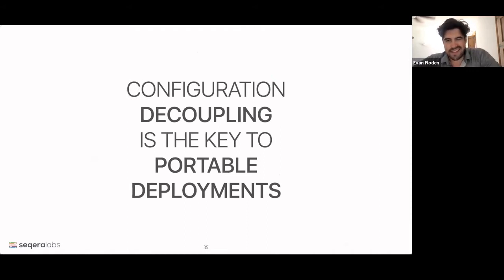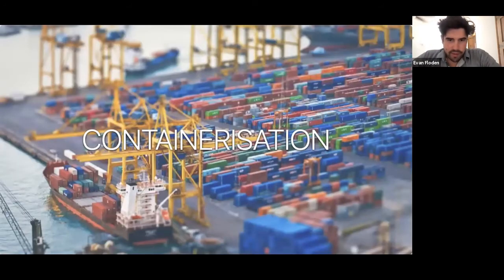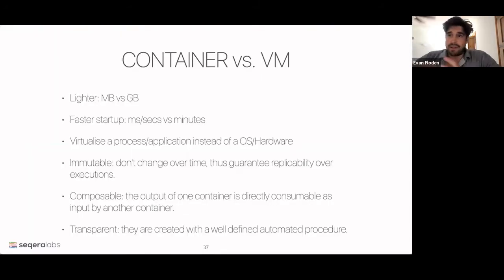Okay, getting towards the end here, and we can jump into some practical things. Containerization is super important for enabling that portability. Containers are very, very light. We'll see this at the end. They're very quick, and you can spin them up very fast. That means they have big advantages over virtual machines, which were typically used. Also, the tooling around containers with Docker, etc., has become very valuable for us to use.